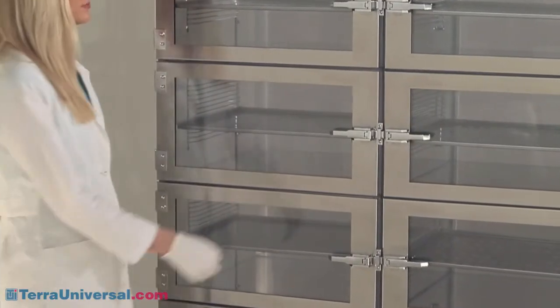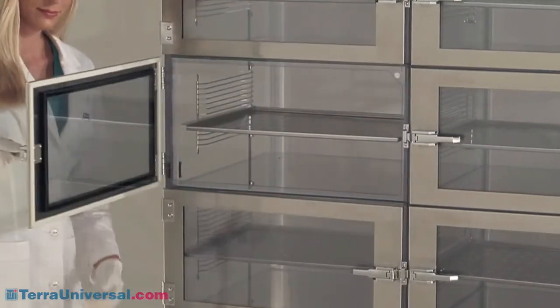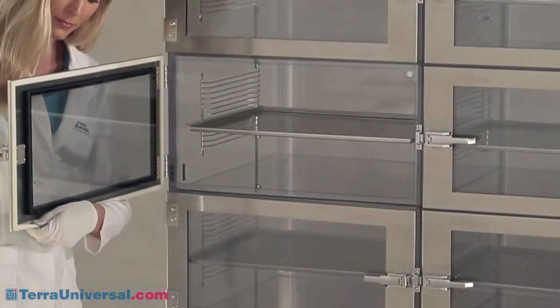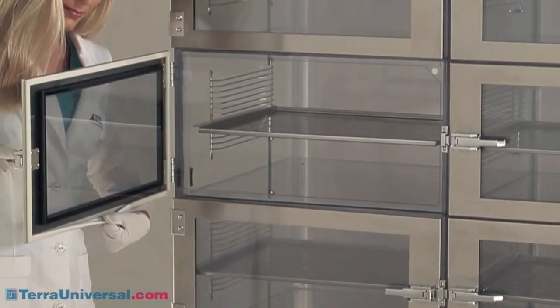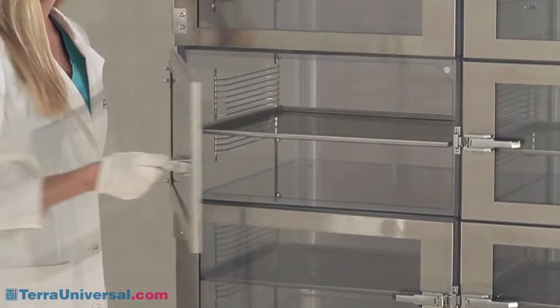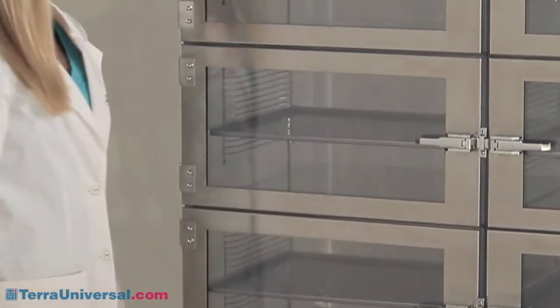Stainless steel door frames make these the strongest, most durable doors on the market. The one-piece gasketing is mechanically attached to the door frame to eliminate adhesives and outgassing problems. They will not creep or deform, and their hollow-formed construction seals better and longer than weather-stripping-style gaskets.